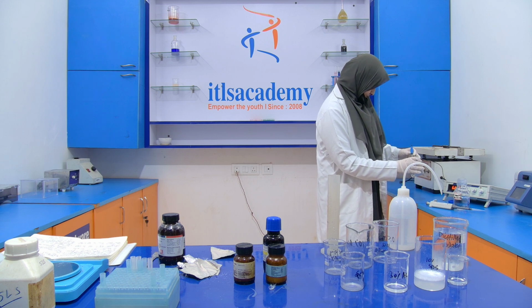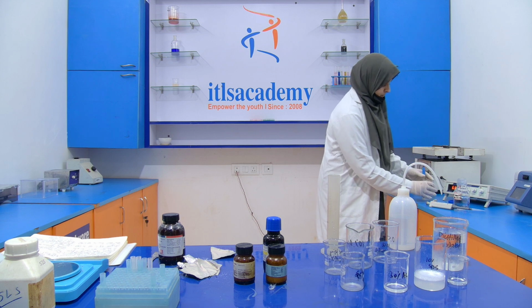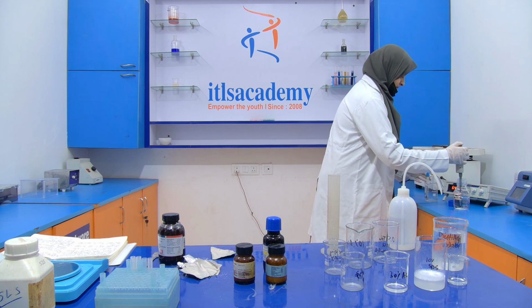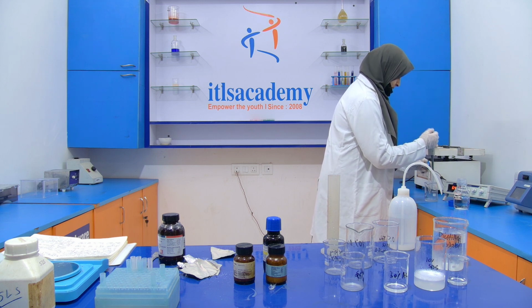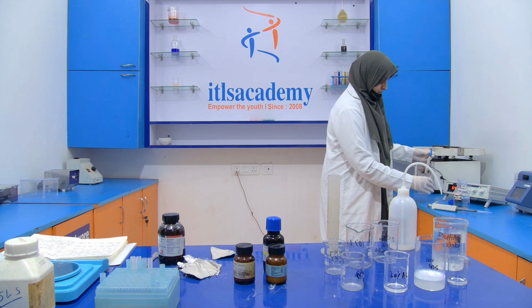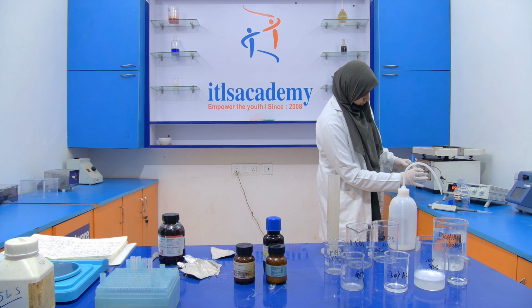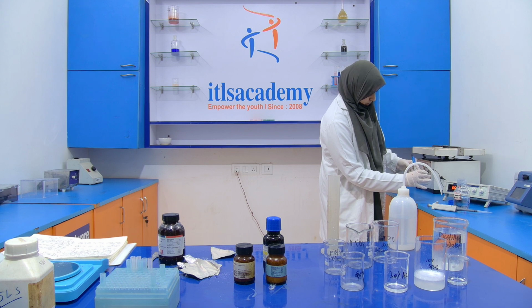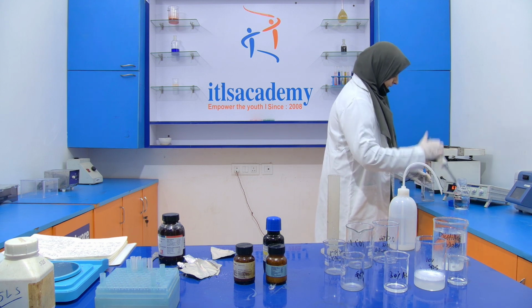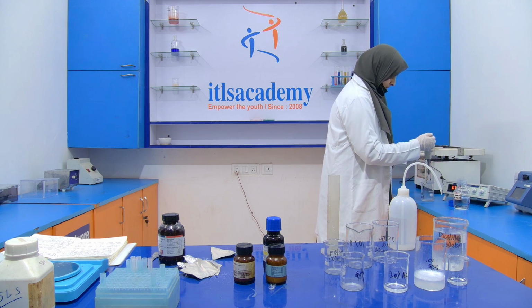You can go and check. Its pH reaches 6.7. So you have to add more.